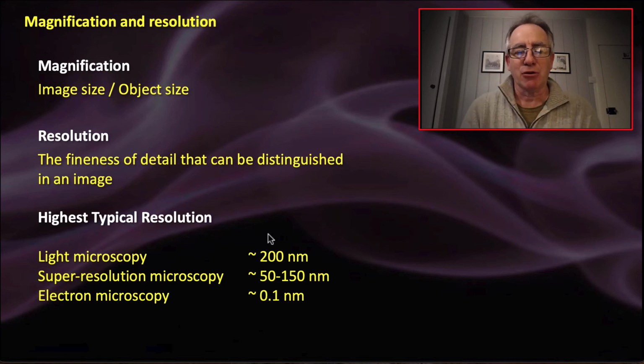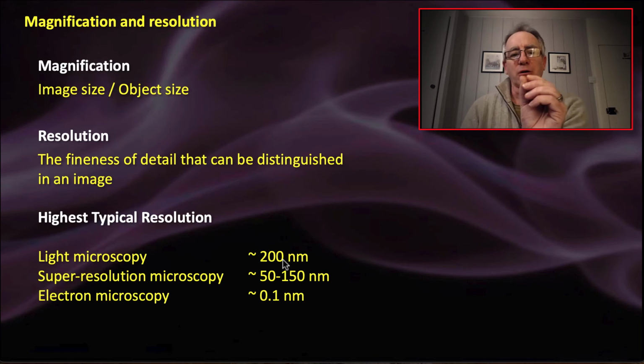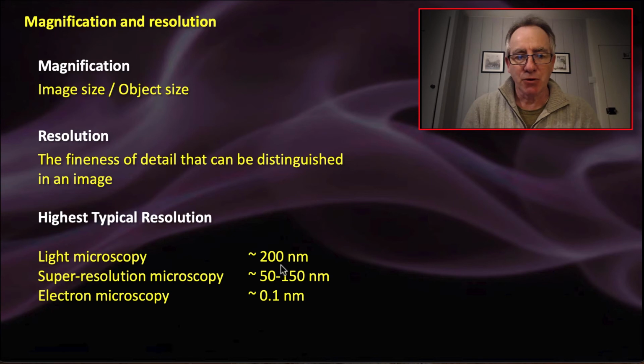You've got to think about your SI units. If you look at a ruler, the smallest division generally on a ruler is 1 millimeter. Divide the millimeter into 1,000. That's a micrometer. That's incredibly tiny. Divide that incredibly tiny micrometer into 1,000. That's a nanometer. 200 of those nanometers, 1/5 of a micrometer, is what the best resolving light microscopes can see.